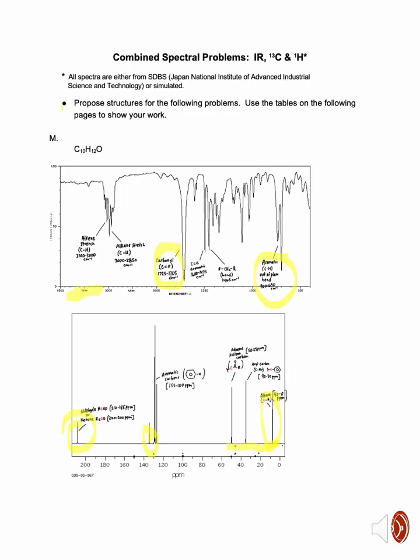Okay, so the first graph that we will be looking at is this infrared spectroscopy graph right here, the IR graph. This is going to tell us the functional groups that we have. So let's take a look and determine those groups. The first thing that stands out for me is the lack of an alcohol functional group.